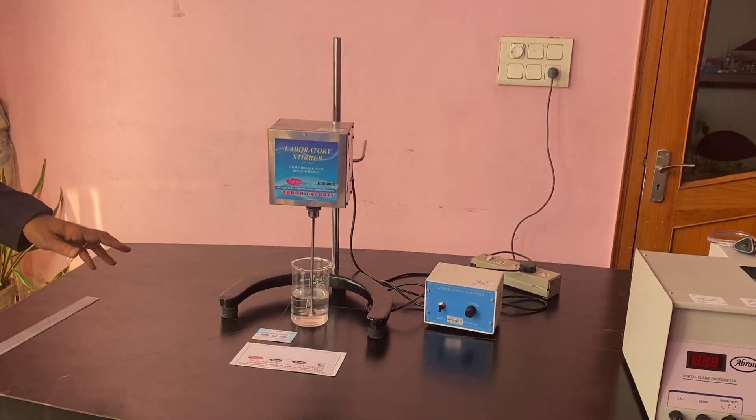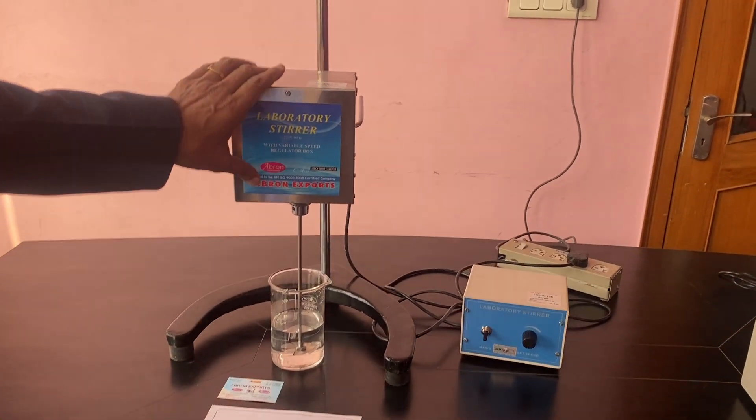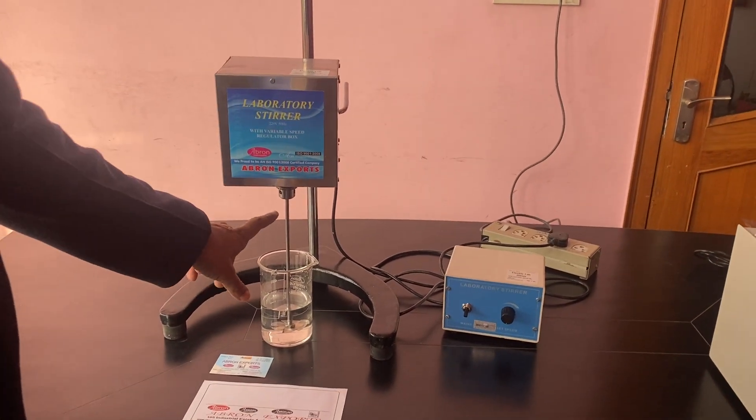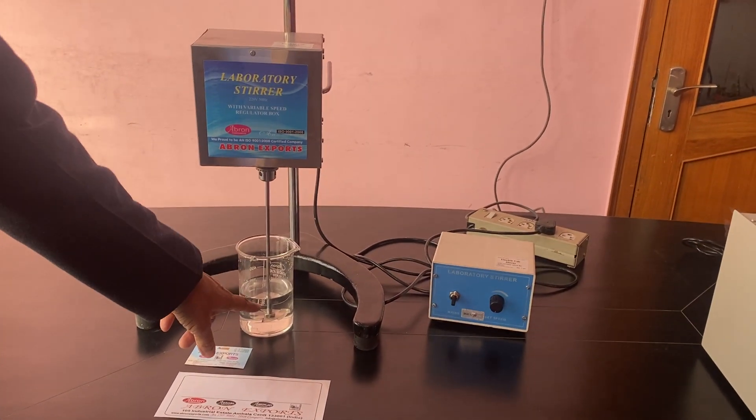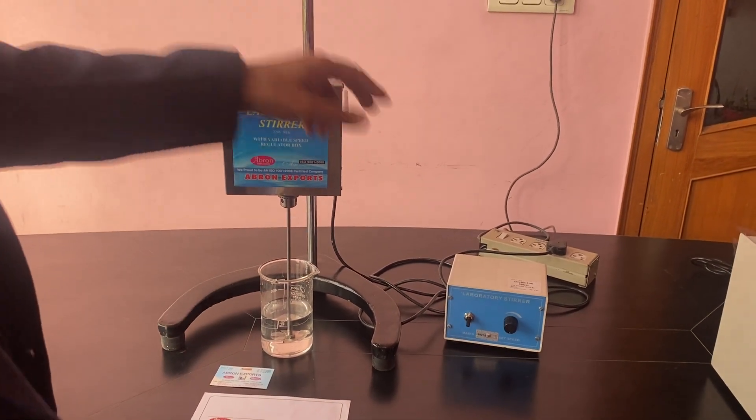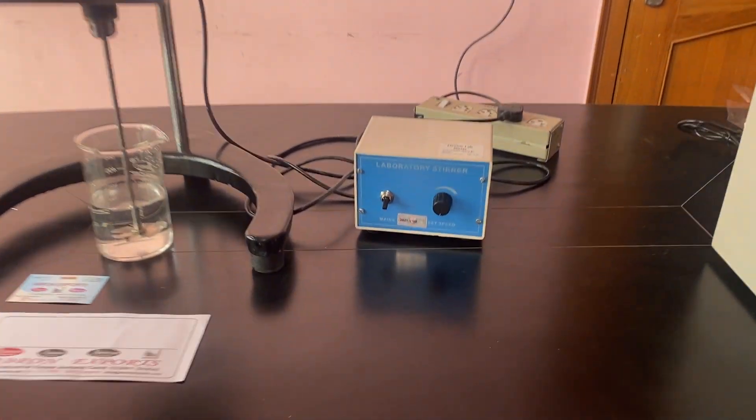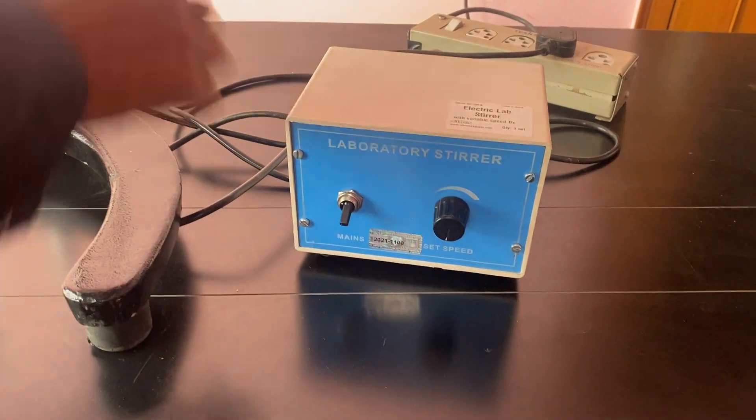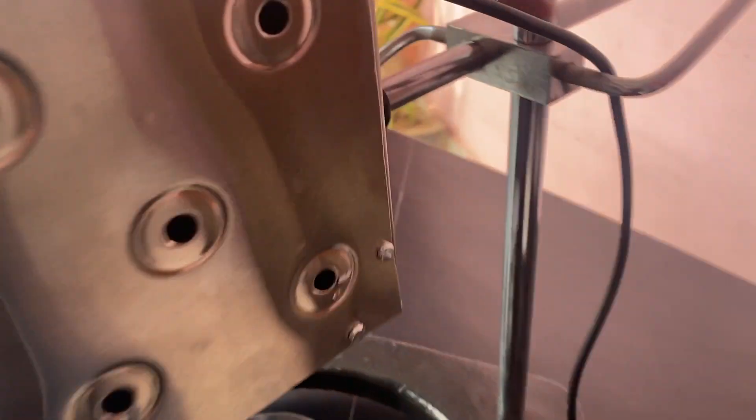This is our laboratory stirrer. It has a chamber, stainless steel box, and stainless steel propeller. This is a speed control box. When you have to start it, there is a clamp for lifting up and down.